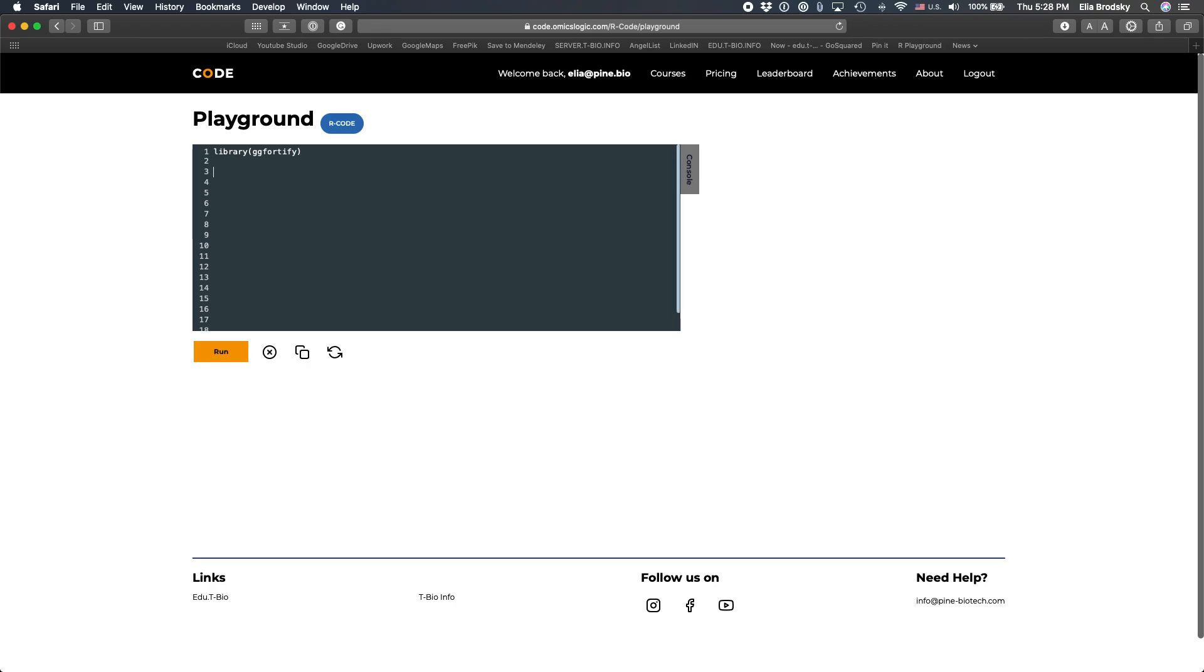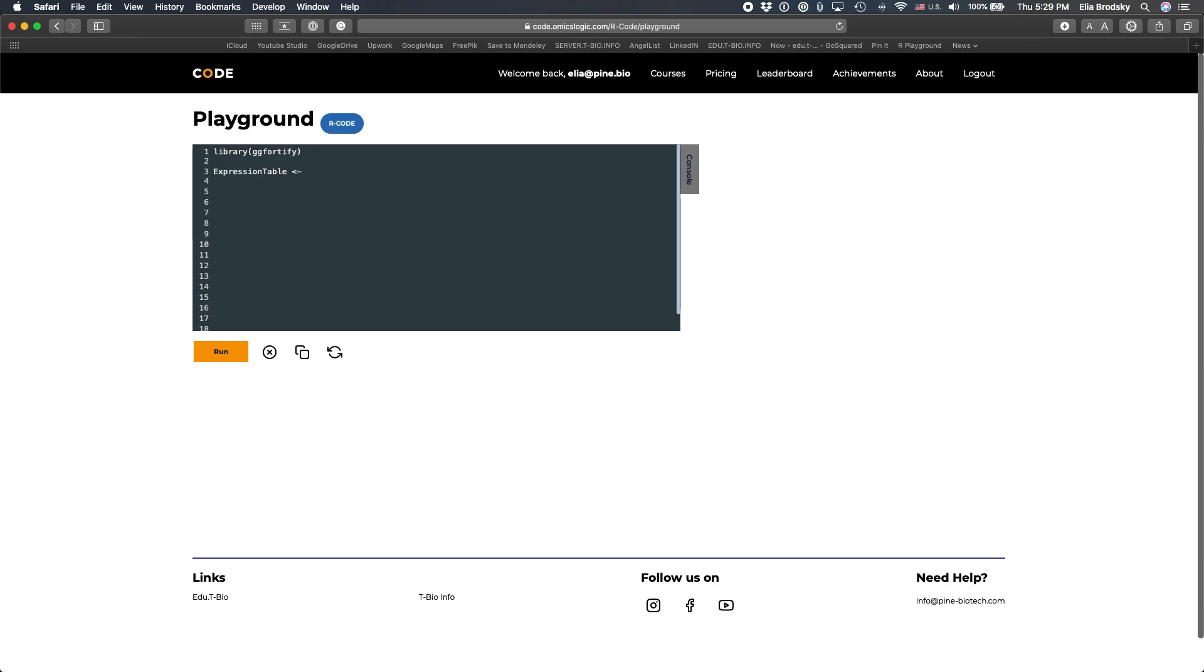The second thing we'll do is load our data. We'll call it expression table. Last time we took an expression table and transposed it. This time I've already prepared a transposed table. The problem is that whenever you do the transposition here, you lose one of the key items in the table, which is one of the column names. So saving that file correctly, separately, is going to be very useful.